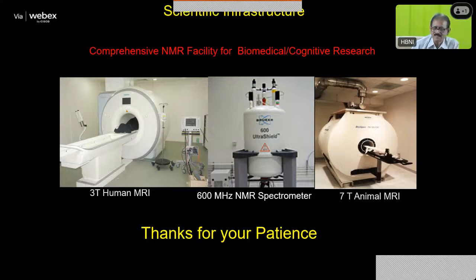Don't hesitate. A participant has very rightly raised whether a paramagnetic ion is going to affect T1 contrast, the relaxation times. Yes, that is a very good question actually.